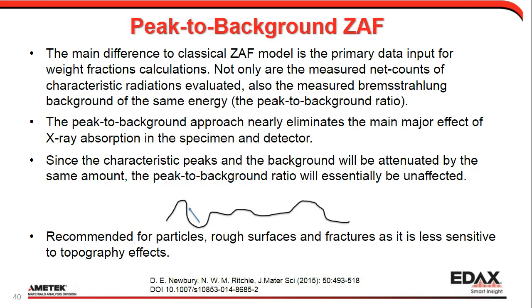We know the traditional ZAF quant model doesn't work quite well on rough surfaces, because there will be additional attenuation of X-rays on the surface that cannot be predicted by the quant model. For the peak-to-background ZAF model, since the characteristic peaks and the background will be attenuated by the same amount, the peak-to-background ratio will essentially be unaffected.